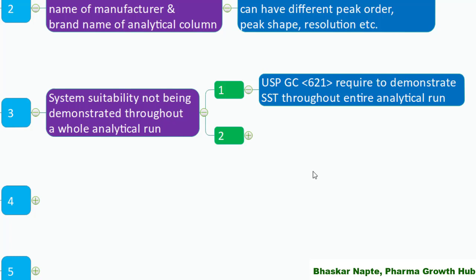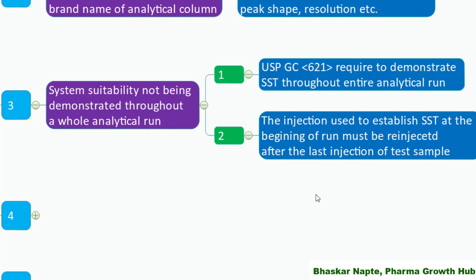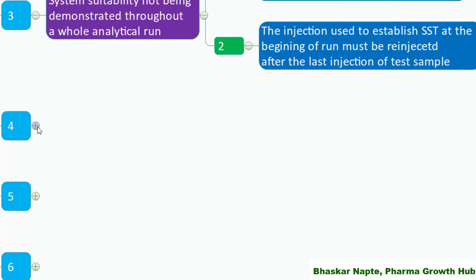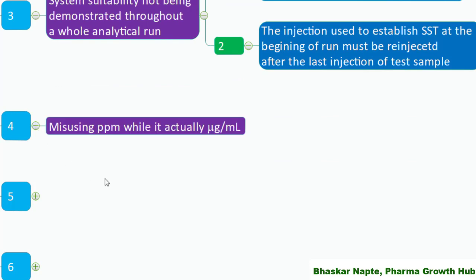In case you are missing this important point, you can take action on it. The injections used to establish system suitability at the beginning of the run must also be re-injected after the last injection of the test sample and at suitable frequency throughout the entire sequence. This is also called the bracketing standard phenomenon.